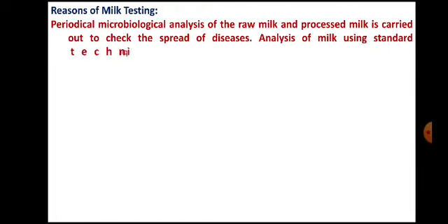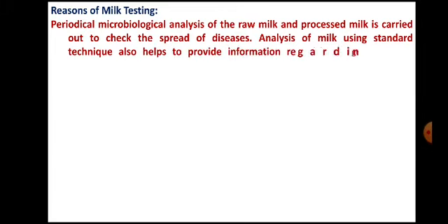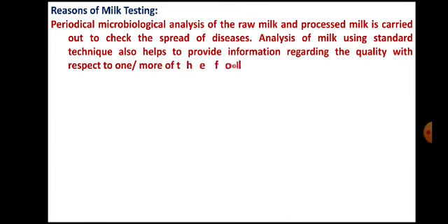Now, there are several reasons for testing of milk. Let me explain this very briefly. Periodic milk analysis is required for microbiological analysis and compositional analysis.